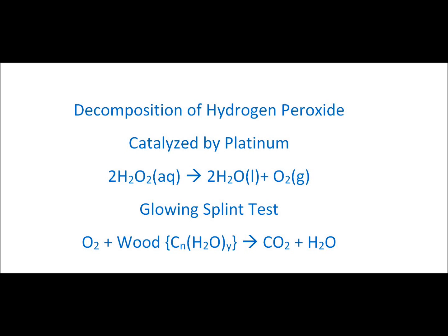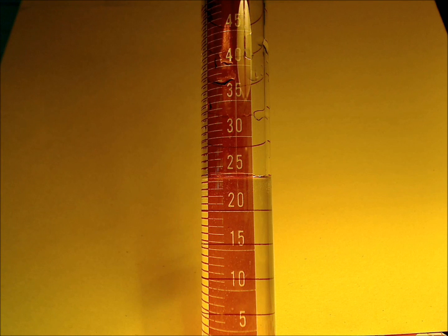I hope you enjoy this demonstration. Okay, so here's the hydrogen peroxide, 25 milliliters, 6%. This is called 20 volume hydrogen peroxide. You can get it at beauty supply stores.